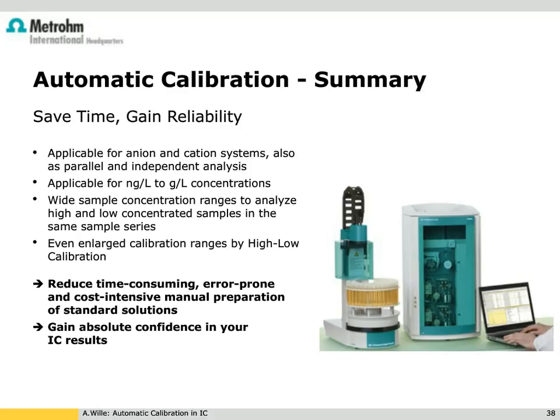The second question came in from Diane, and this is aimed at Andrea. My baseline is very noisy. What can I do? If the baseline of an ion chromatography system is noisy, it can have different reasons. First, I would check that I have no air bubbles in my eluent, so if the inline degasser is working well, or if I have degassed my eluent manually properly.